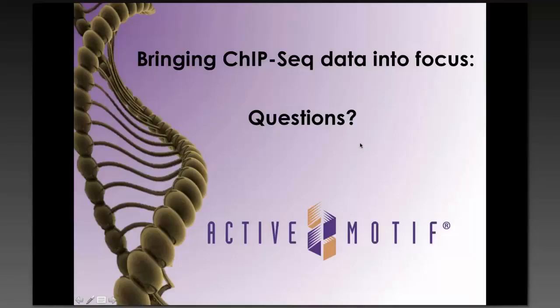Why not some other organism? So in theory, any organism could be used. We liked Drosophila, one, because it has a small genome, so we won't overwhelm the system with the spike in. And two, we were aware of this antibody that specifically recognized the Drosophila protein. With that, the system can become universal, that you can use the same antibody as with your spike in any system.